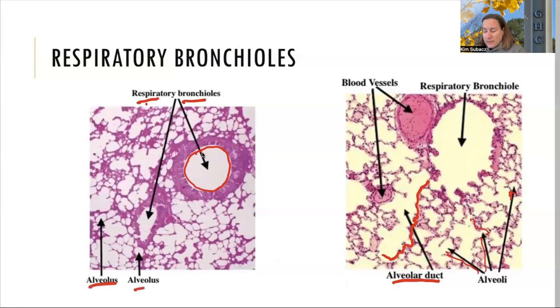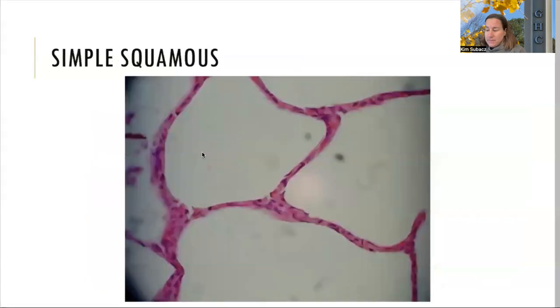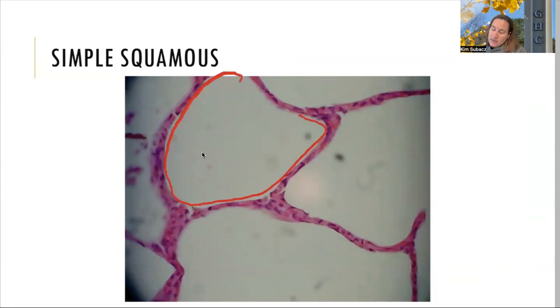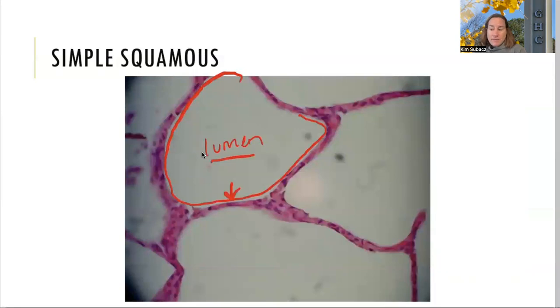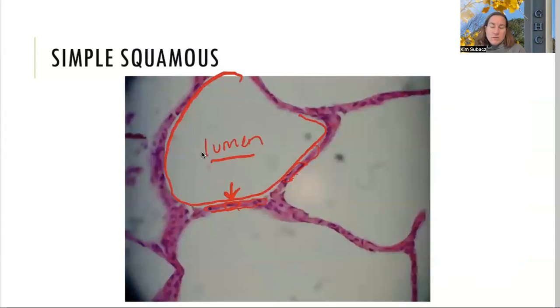We're going to zoom in a little bit closer so we can see the epithelium that lines those alveolar sacs. They are going to be simple squamous. All of this is one of the alveolar sacs, and this is going to be air space — anywhere we have a gap for air, blood flow, or hollow space is the lumen. The air coming in goes through this simple squamous epithelium lining the alveolar sacs. Each one of these is a little cell — remember, simple squamous epi is pancake-shaped and very, very thin, which makes them excellent for diffusion and filtration.